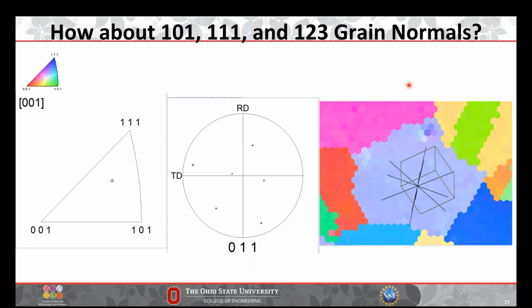And you can do this with basically any zone axis you want to and any sort of crystal system you want to. You can just ask OIM software to do it for you, instead of staring at pole figures for a long time and trying to guess, okay, well, this is the way I need to draw this, or trying to find a magic grain that lines up either horizontally or vertically based on the other two orthogonal directions from the beam direction.